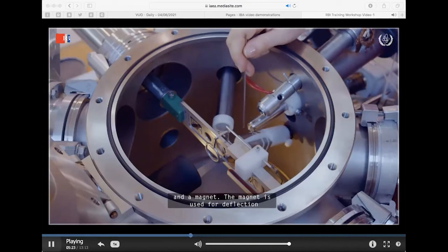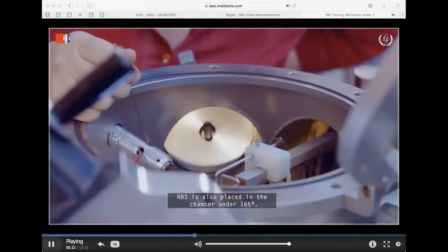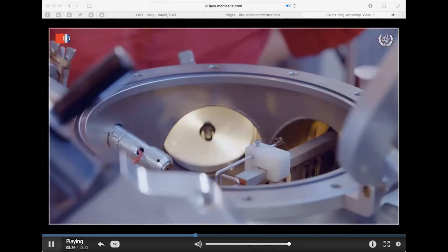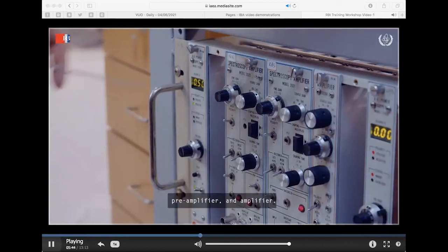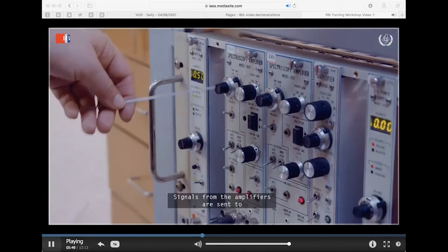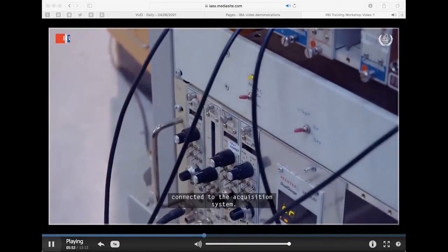A magnet is used to deflect backscattered protons, which can degrade the performance of the detector. RBS is also placed in the chamber at 165 degrees. Each of the 3 detectors we are using has its own set of pulse processing electronics, which consists of a bias power supply, preamplifiers, and an amplifier.